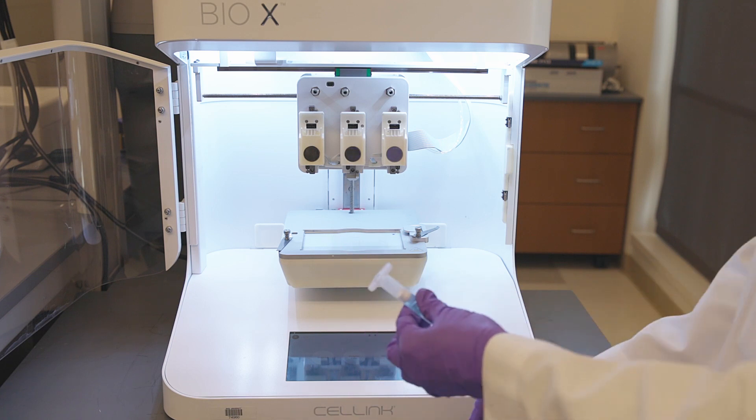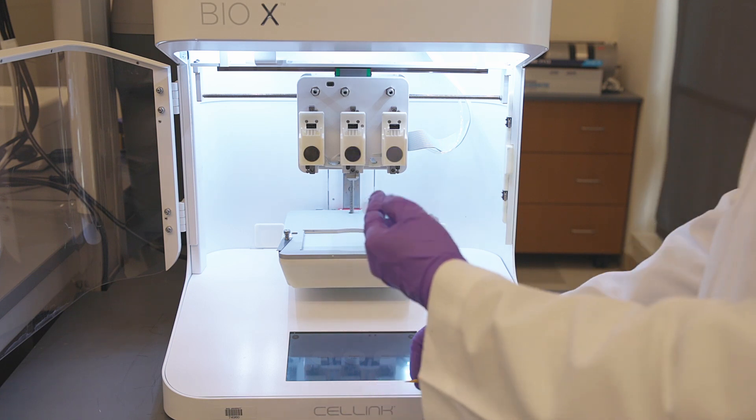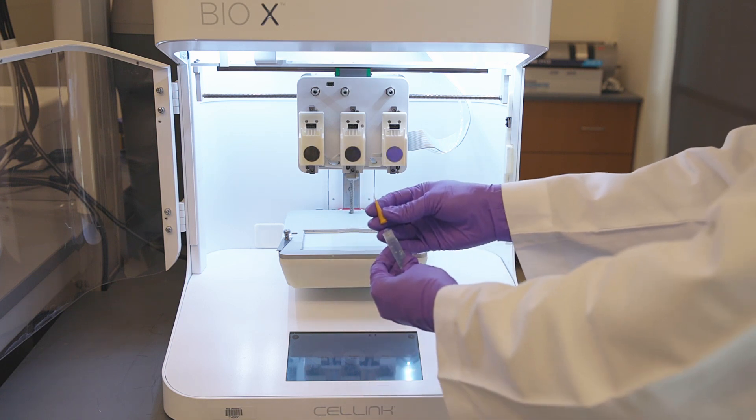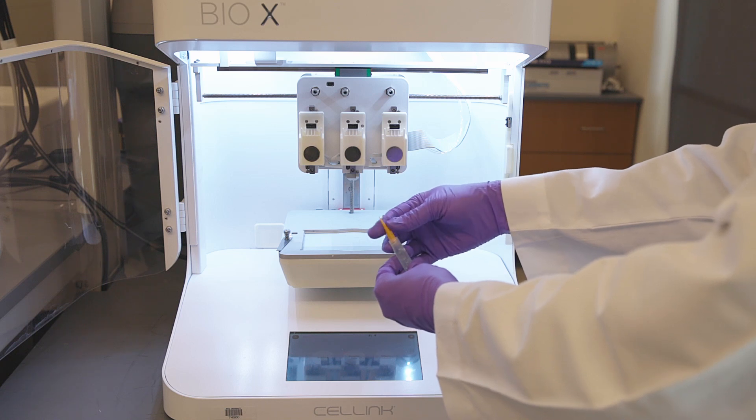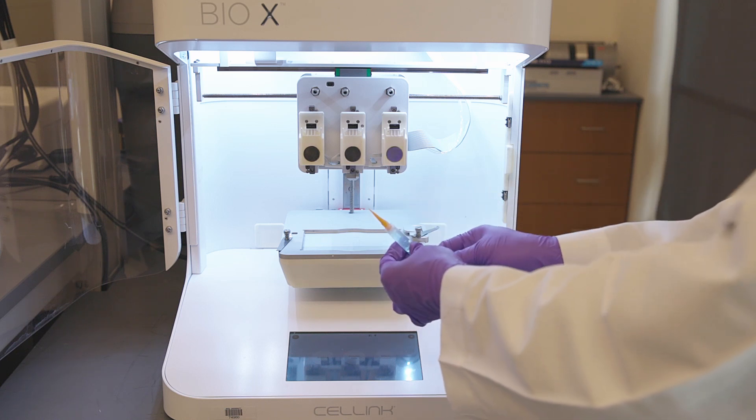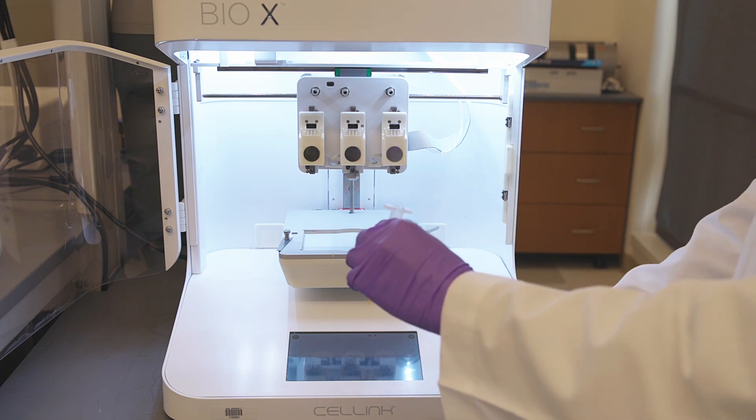On the luer lock end, we will be inserting the needle of our desired gauge. Today, we will be using a 23 gauge tapered needle. On the other end, we will be inserting the air compressor line adapter.